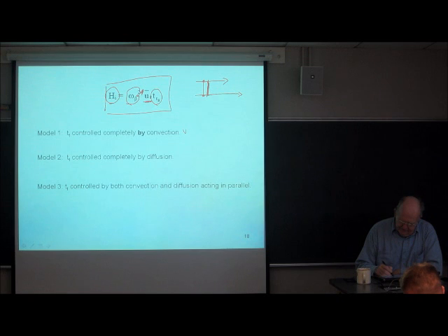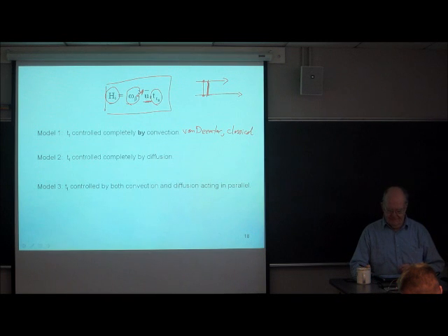So I'm going to call this the Van Deemter approach. And I'll also call it the classical approach, because it was the earliest.